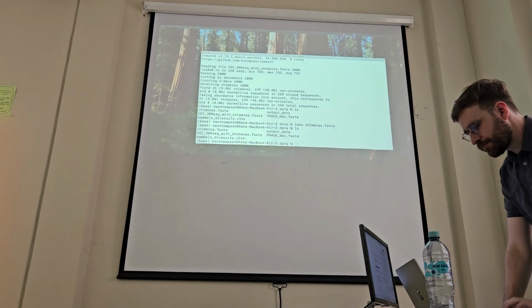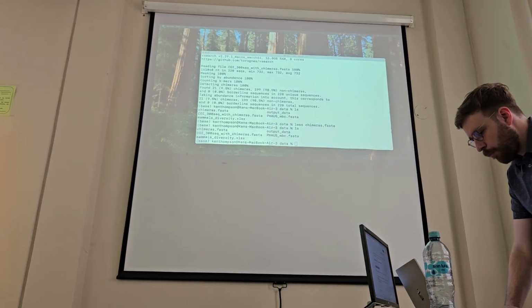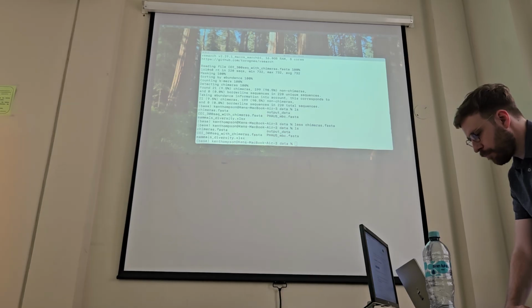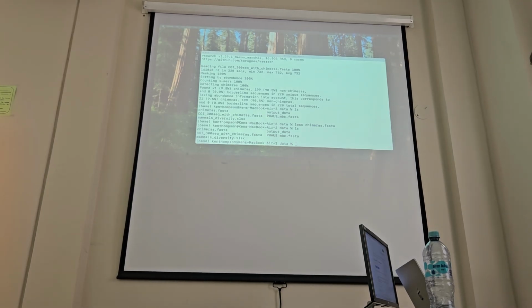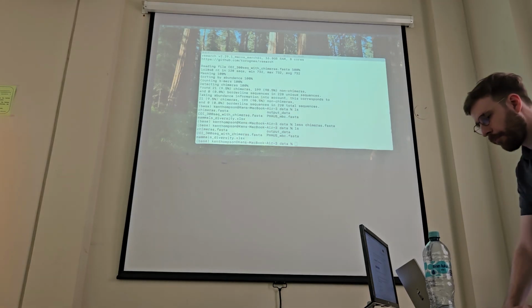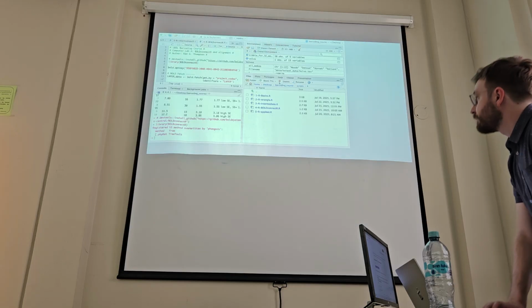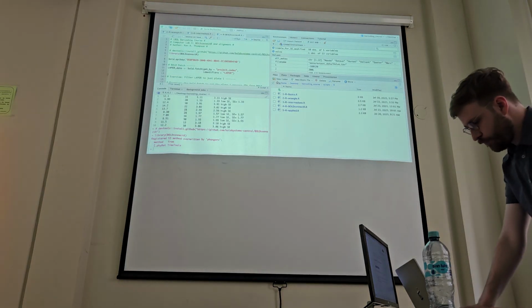So in R, open the script R for Bold Connect R. I cannot see this. Oh, yeah. And then here. Thanks, Robin. Okay, too small.